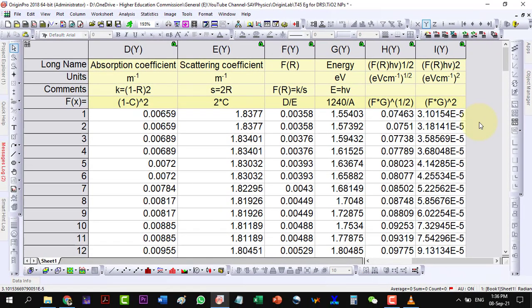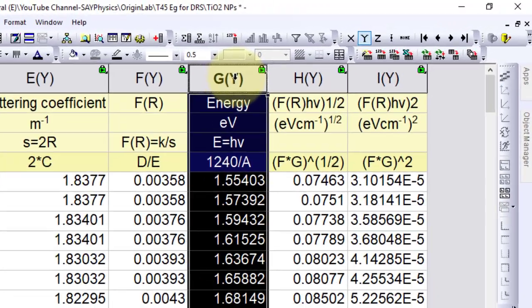Now, in order to plot hν versus F(R)hν for gamma, where gamma is one-half and two, we change column G to X axis.